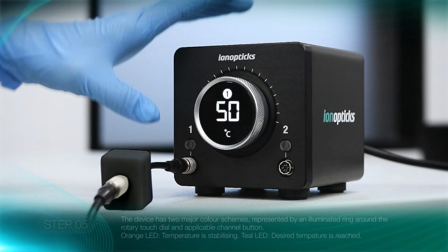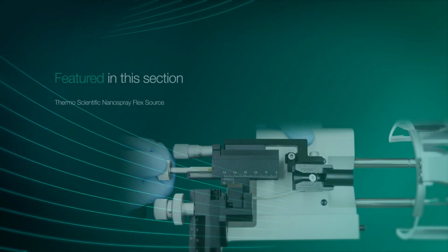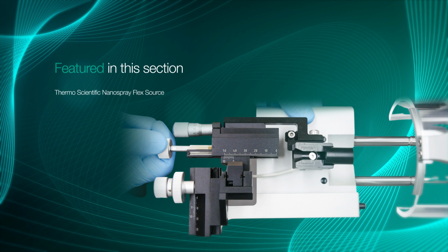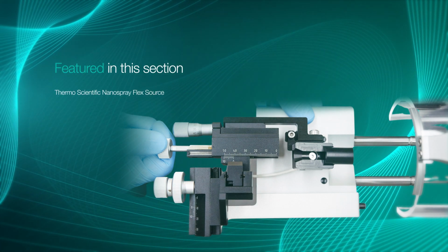This footage has been sped up for illustration purposes, but the controller should achieve your desired temperature in only a few minutes. The following section demonstrates how to install the HeatSync Rapid housing into the Nanospray Flex source using the Nanospray Flex adapter supplied by IonOpticks.